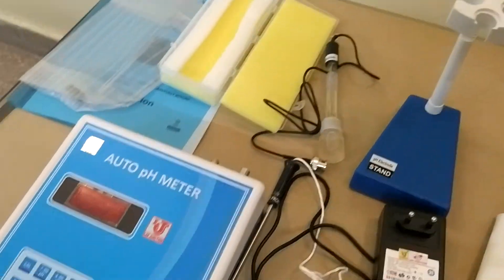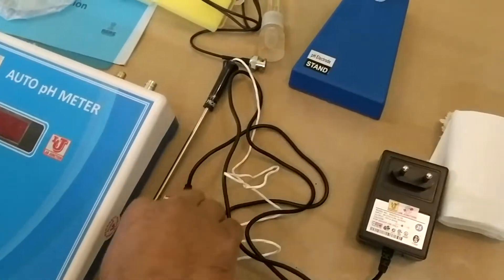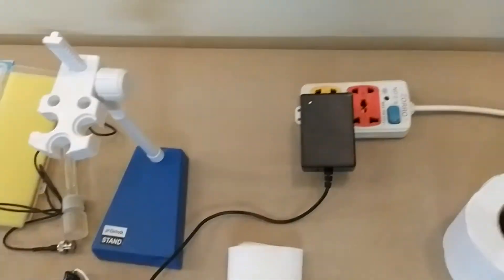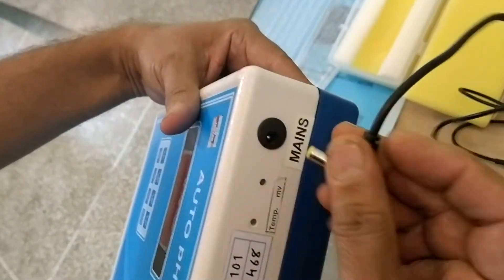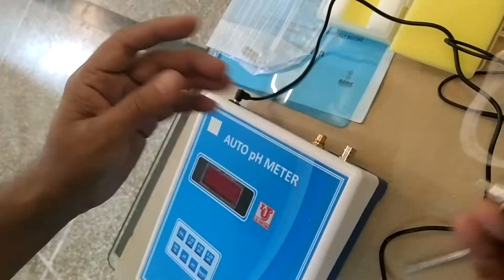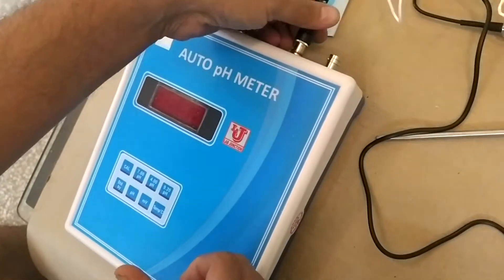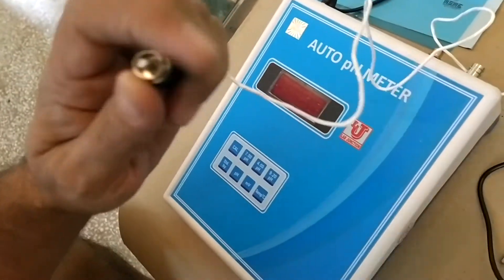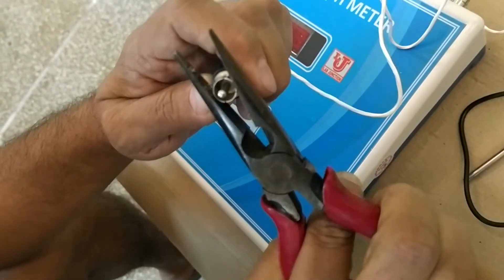Now, how to install the Lab Junction Auto pH Meter. First of all, you can take your 12-volt adapter and plug it in on this side. Now you can plug in the temperature probe this way. Sometimes temperature is not detected by the auto pH meter.